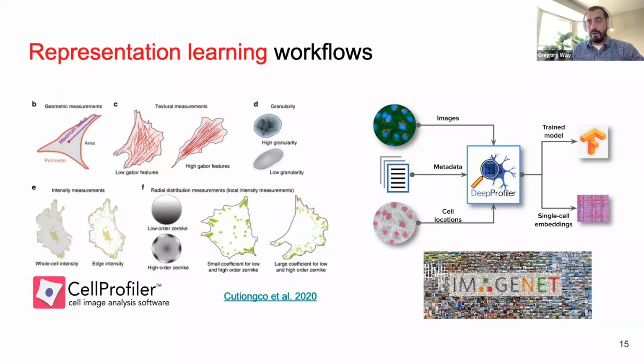Perimeter and area are obviously going to be different because they're more traditional morphology features that directly report on the differences. But for a lot of the intensity-based metrics and radial distribution metrics, there's a transformation step that takes the different shapes and morphs them into a common shape and then makes the calculations from the common shape.